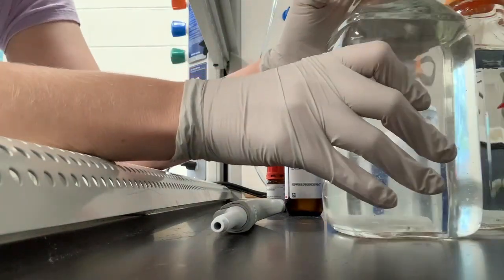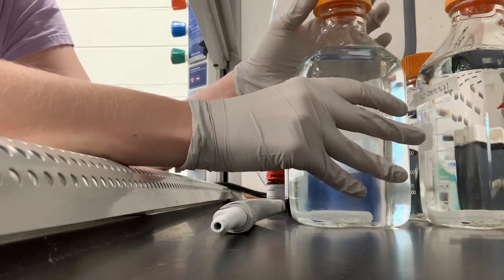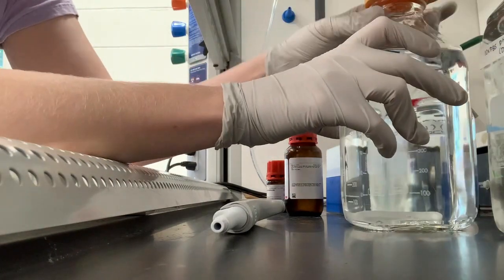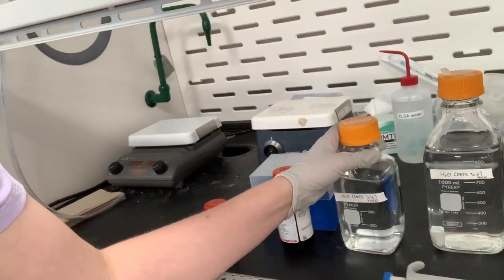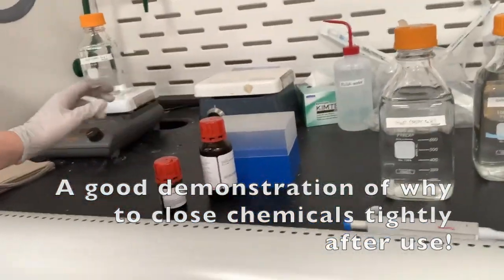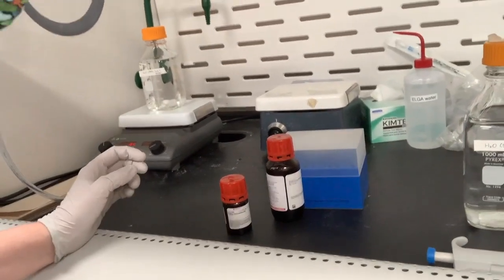After you do this, you want to take the bottles and loosen the lids just a little bit, so not all the way off, but loose. So we'll do that for each of them. And then there are some stir plates in here in the chemical hood, and you can put your solutions each on one of these stir plates. Try not to knock things over. And allow them to stir overnight.